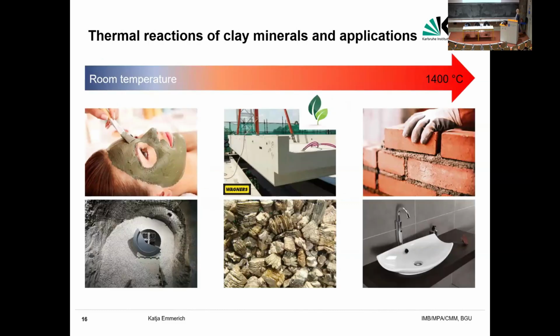And those thermal reactions are interesting for several applications. So at room temperature and low temperatures, hydration and dehydration behavior is interesting. For instance, for the use of clays in medical applications or cosmetics, and also for the use of clays in environmental protection, for instance, in radioactive waste deposits.